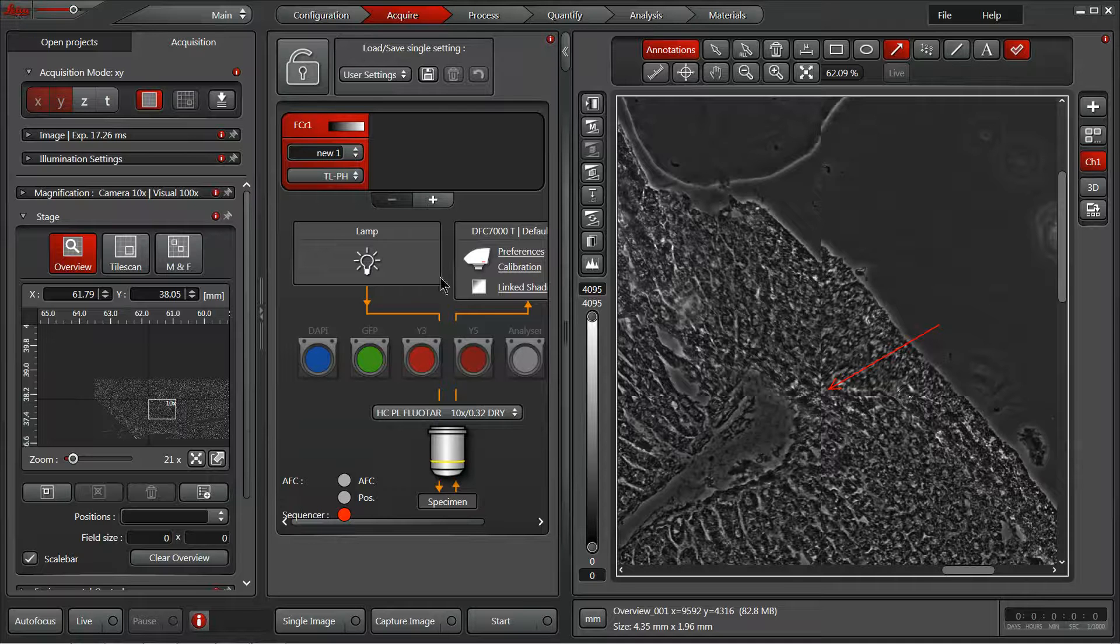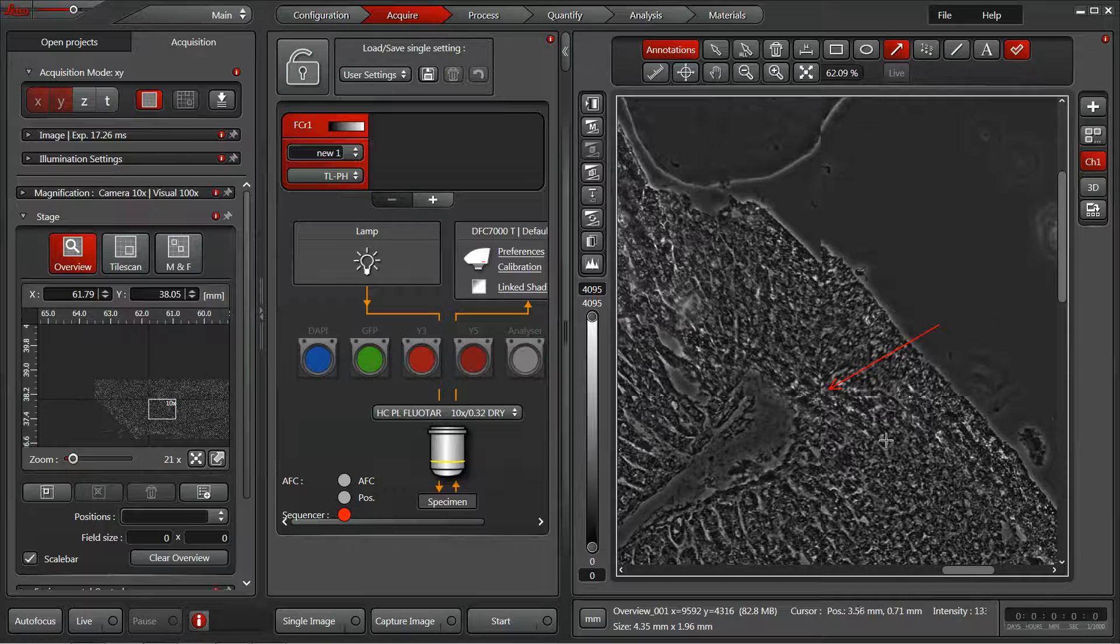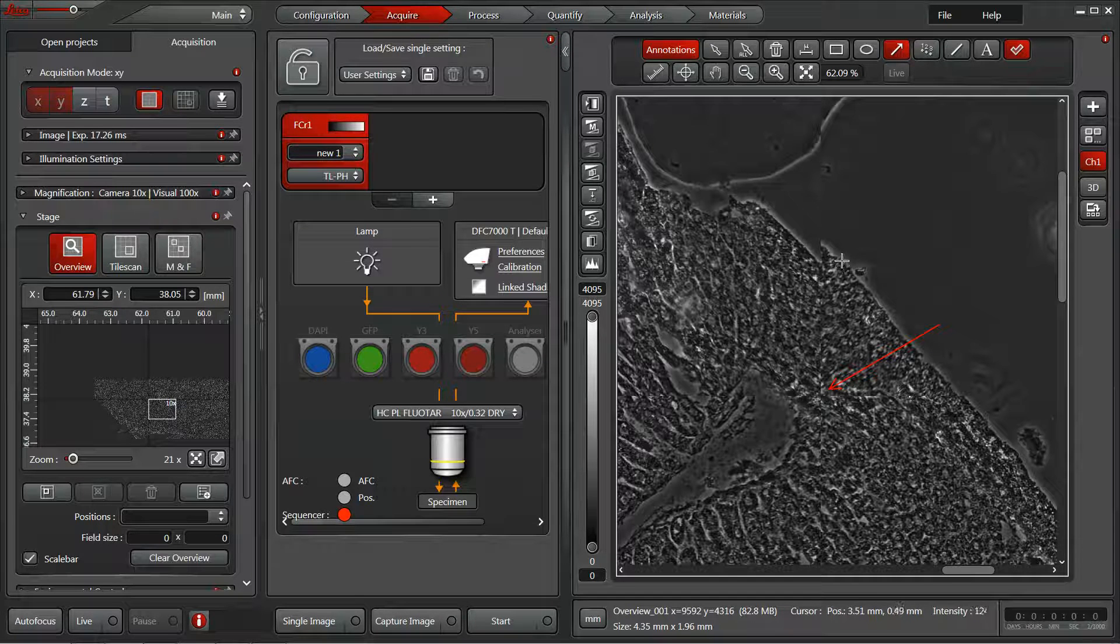Now with our overview finished, I wanted to point out one of the limitations. While quick and easy, the overview does not do any blending of the images.